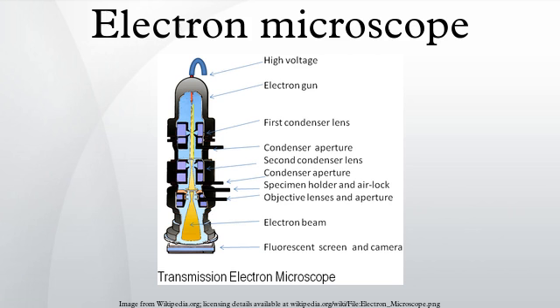Earthing: to avoid electrical charge accumulation on a conductive coated sample, it is usually electrically connected to the metal sample holder. Often an electrically conductive adhesive is used for this purpose. Disadvantages: electron microscopes are expensive to build and maintain, but the capital and running costs of confocal light microscope systems now overlap with those of basic electron microscopes.